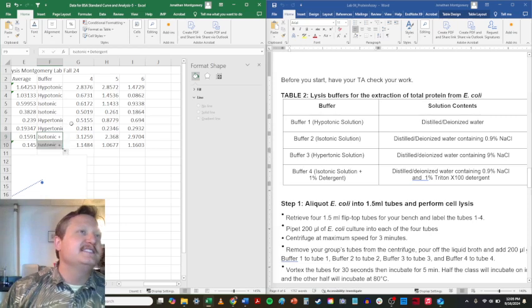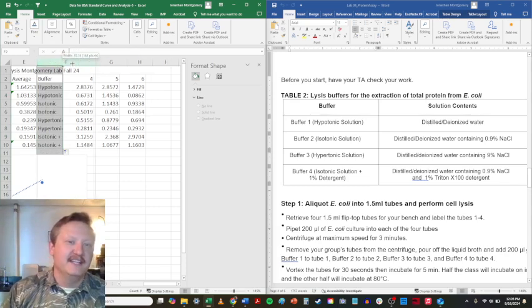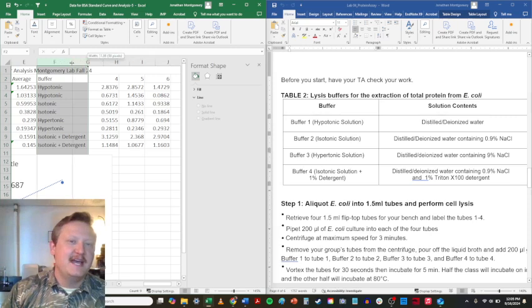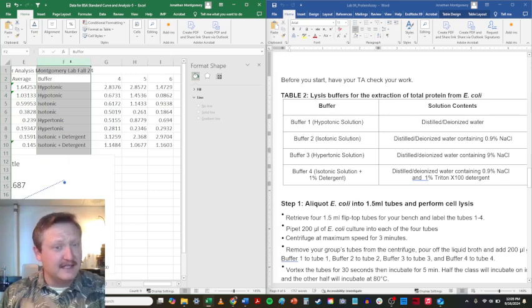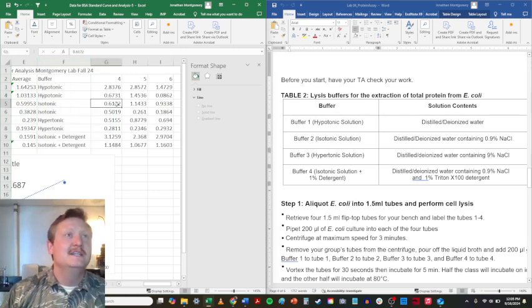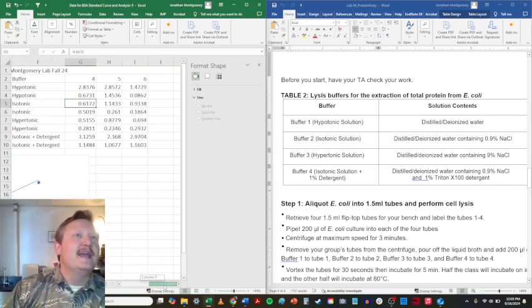Another fun little Excel pro tip, if I click the F column and highlight it right here, and then I go to where I can resize that manually, or you can just double click right there, and it'll resize it to fit all the text that you have in that column, which is nice when you're referencing data. Okay, cool. So we have the buffers.